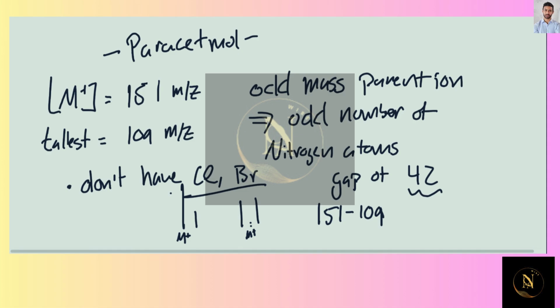And that's basically it. I mean, that's 3 observations you could make from a mass spectrum. Anything else? I'm sure there's other things, but there's at least 2.